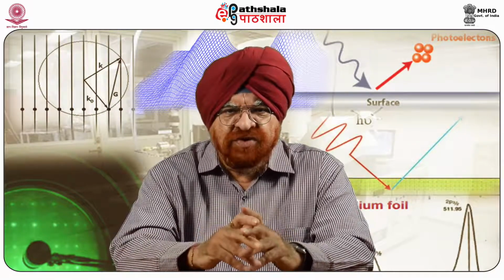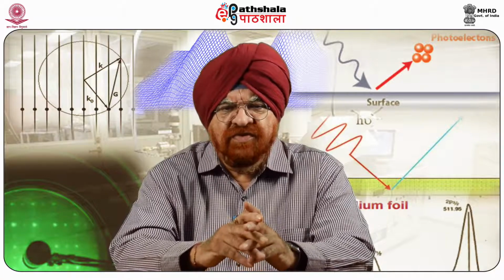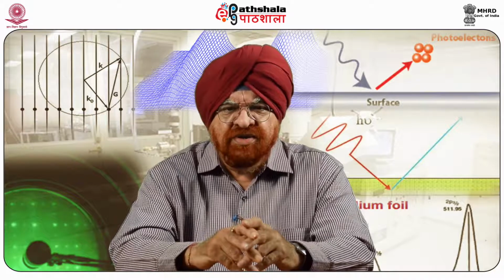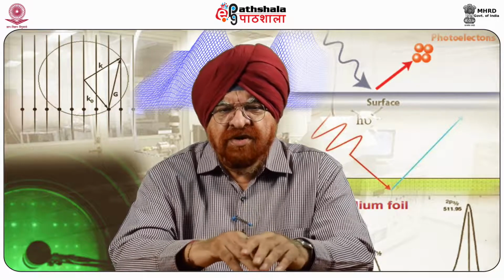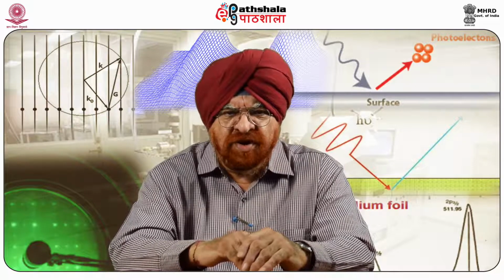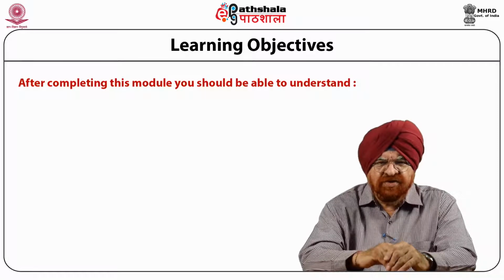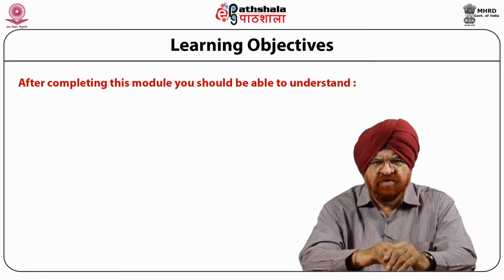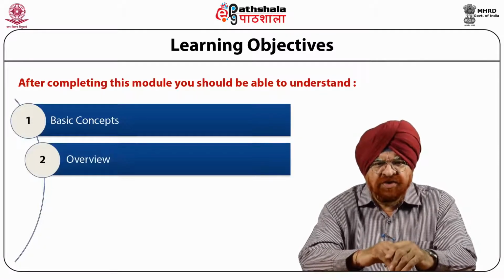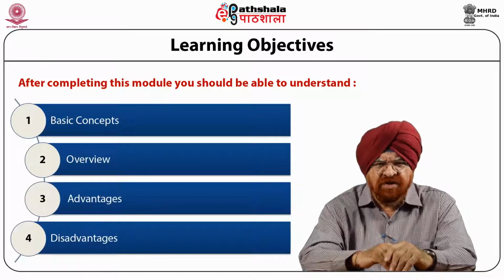Today, we are going to discuss the module Magnetic Force Microscopy. We will deal with the introduction part in this particular presentation. This comes under the paper called Surface Analytical Techniques Part 1. When you finish studying this module, you will be able to understand the basic concepts, an overview, and the advantages and disadvantages of this particular technique.